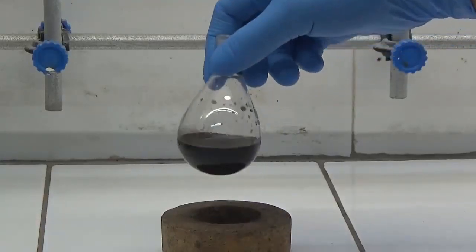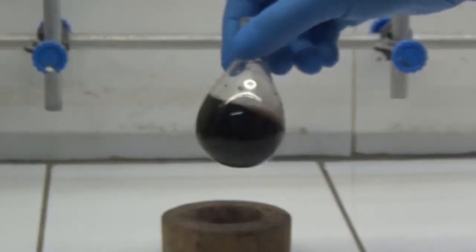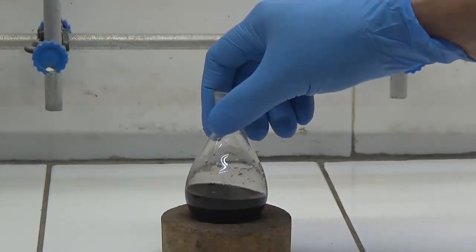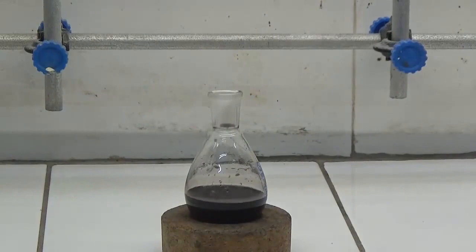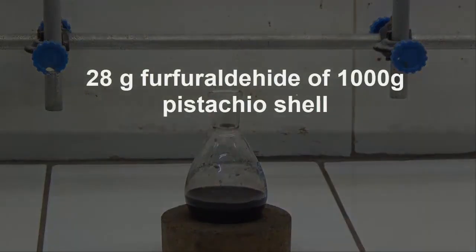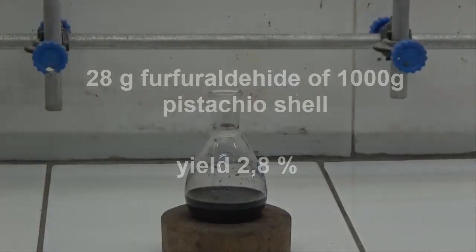It is observed that the distillate is colorless, but after a couple of hours it becomes dark. The yield of 1000 grams pistachio shell was 28 grams, 2.8%.